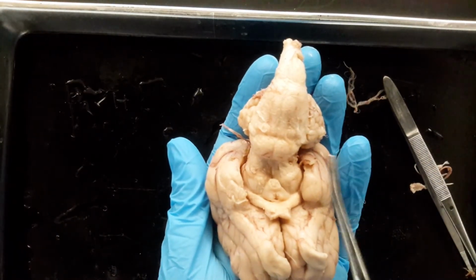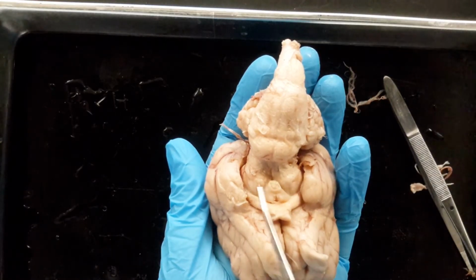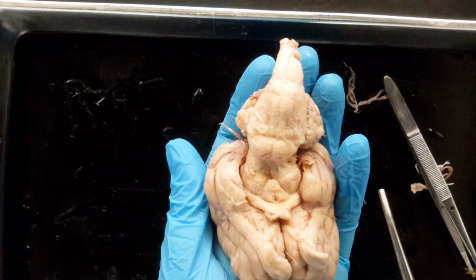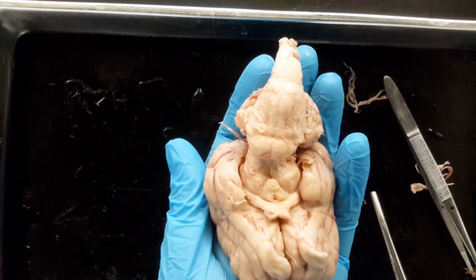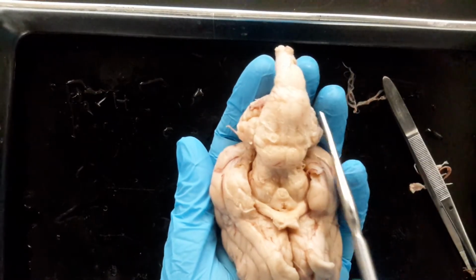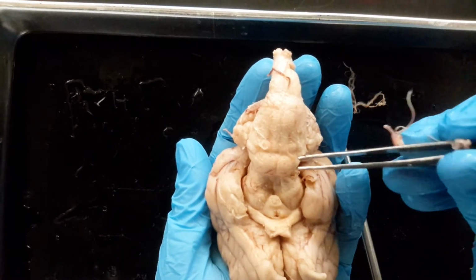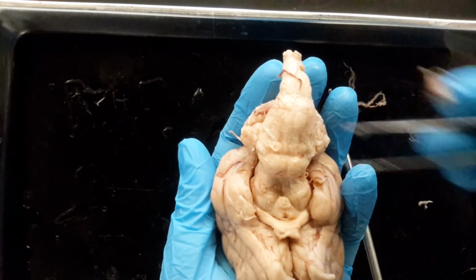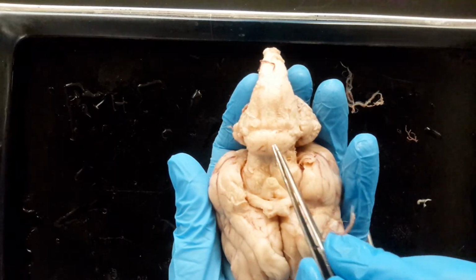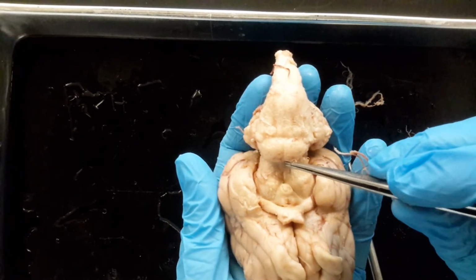On either side of the mammillary body, see these two bumps? Those two bumps are called the cerebral peduncles. Peduncle. It's kind of a fun one. Below the cerebral peduncle, you have this bump. Split down the middle, bump, bump. Anybody know what that one is?